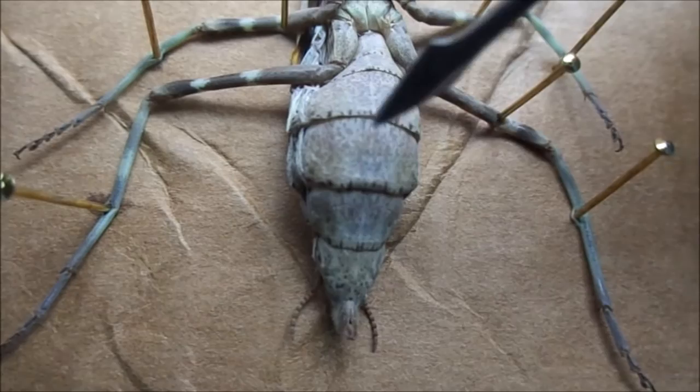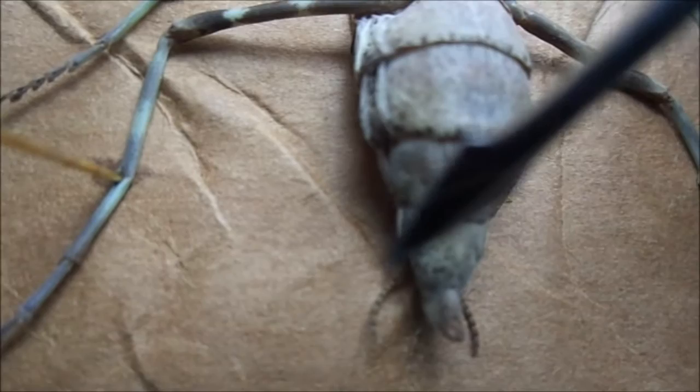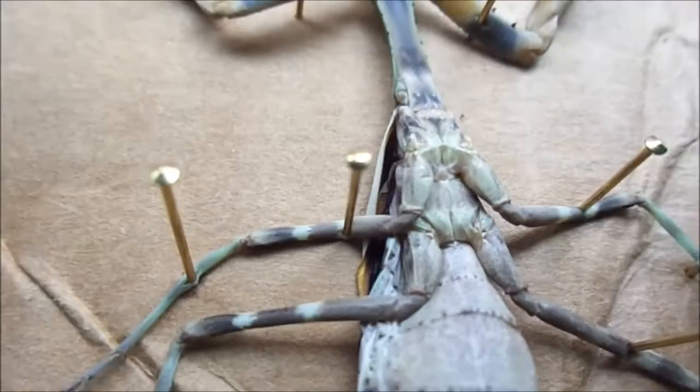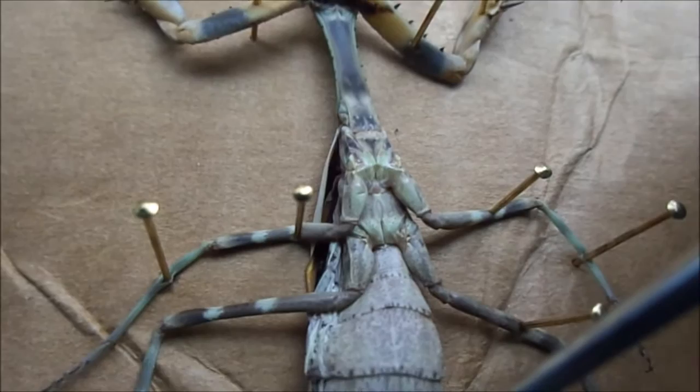Moving down the body, as I said, you can see these segments — one, two, three, four, five, six — which denotes it as a female. You have the cerci down here, which are little bobbly string things used to sense wind direction, helping the mantis take off and fly. These are pretty vestigial in this mantis because it is a bud-wing mantis, which is actually flightless. The wings, which I'll show you in a second, are completely vestigial.